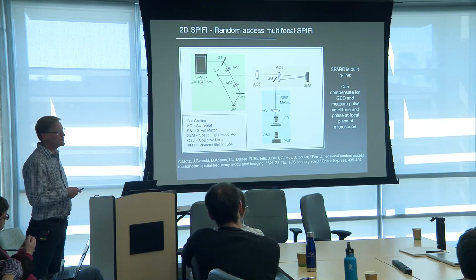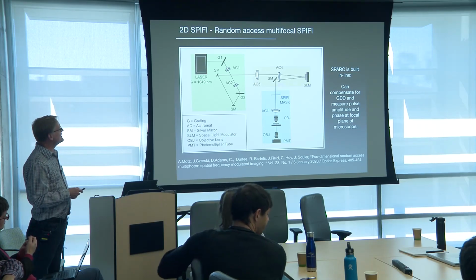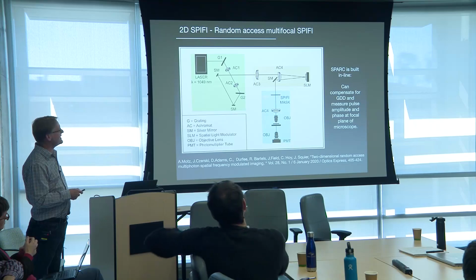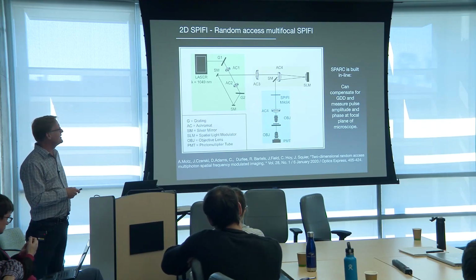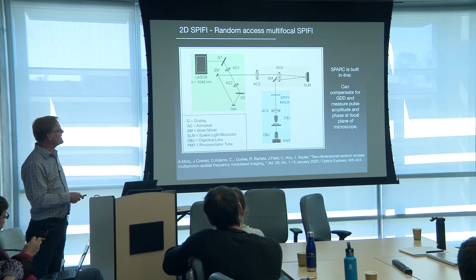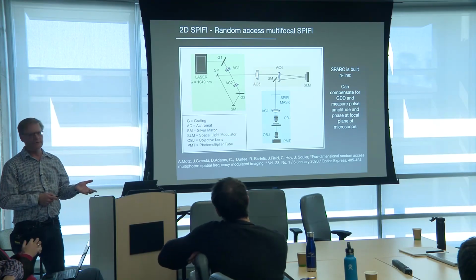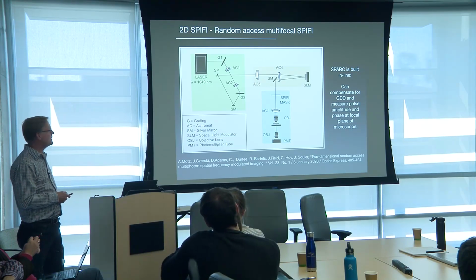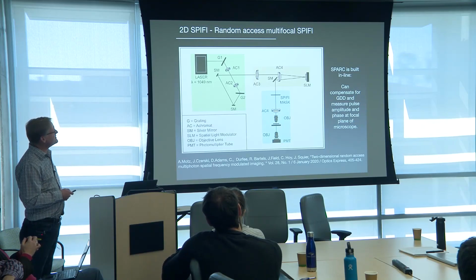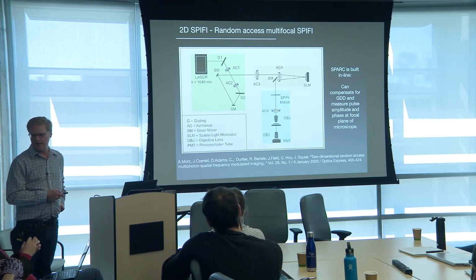Okay? So we're not going to use lines. We're going to use individual foci. And then the Fourier transform of this gets imaged onto the SPIFFy mask, and those images go to the focal plane. But now we can do multifocal, multiphoton excitation with single element detection. And it's really programmable as well. And what's nice, as you'll see in a minute with the SPARK system here, is that I actually measure the pulse duration right at the focal plane of this entire system as well.